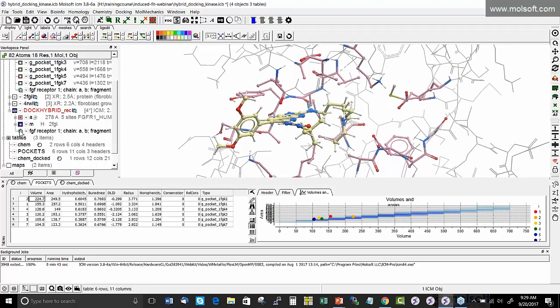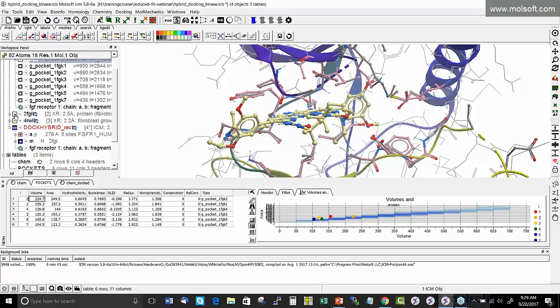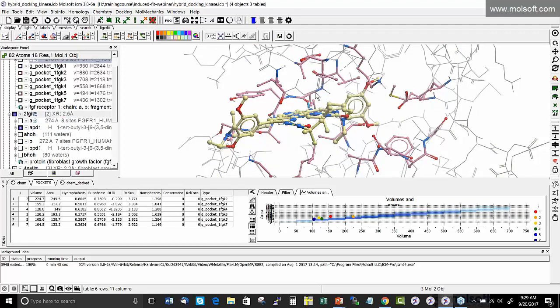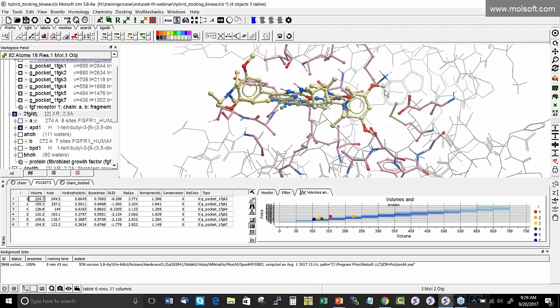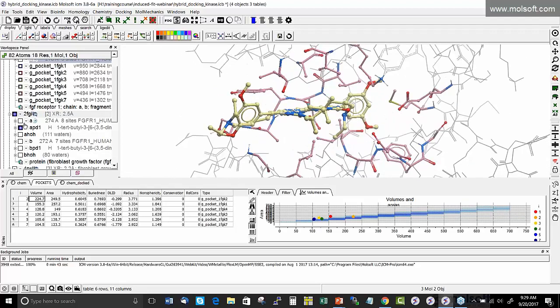And that's because in order for these inhibitors to dock, let me just show you, the inhibitor comes into this space here. And in the apo structure, this lysine is blocking the way. So this lysine, we can see if you superimpose many of these structures that this lysine comes in and out of the pocket. And so it's pretty flexible.